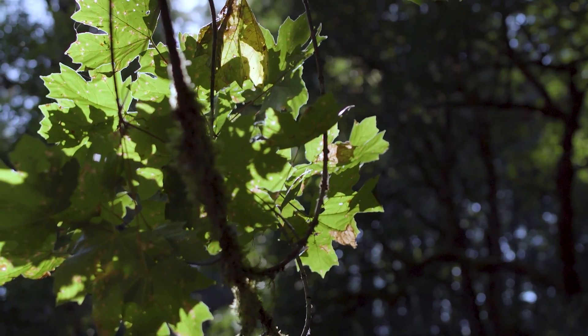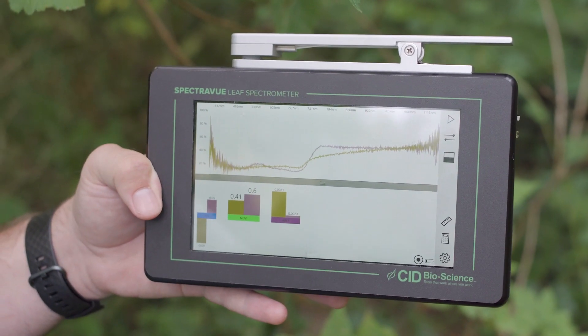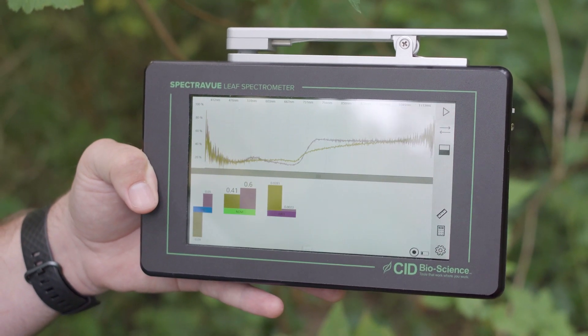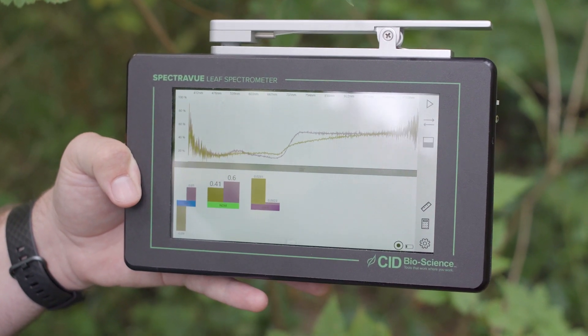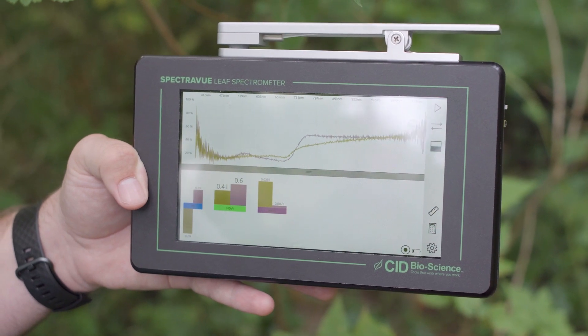So now that we've taken our two measurements, the first one of the healthy leaf and the second one of the unhealthy leaf, I want to show you how that data is displayed and visualized on the home screen of the SpectraView.